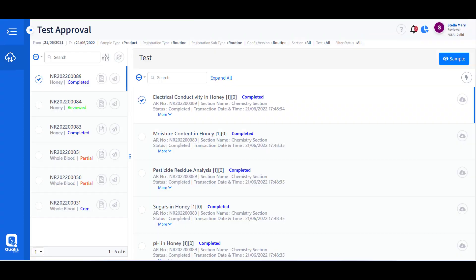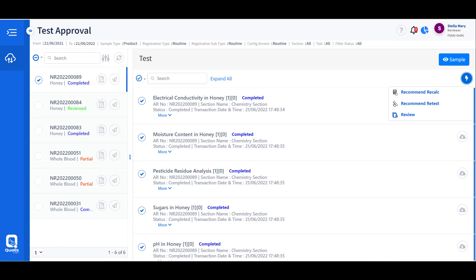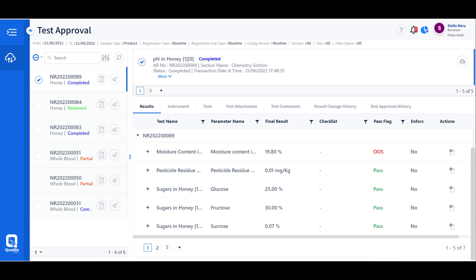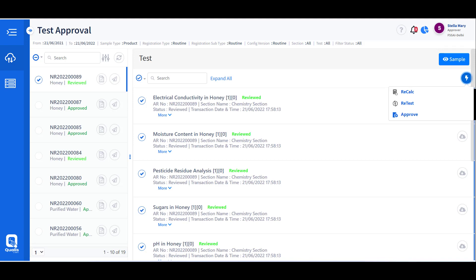When logging in as a reviewer, the user is presented with alerts showing what is pending for review. From the list of tests to be reviewed, the reviewer can select a sample test and choose from various decision options: recommend retest, recommend recalculation, or approve the results. Recalculation allows results to be corrected for typo mistakes, while a retest requires the analysis to be conducted again from scratch, with old and new results passed back to the reviewer.